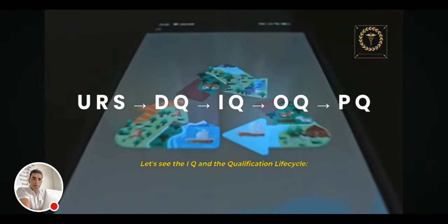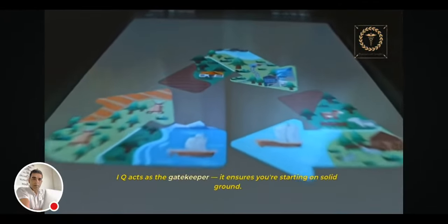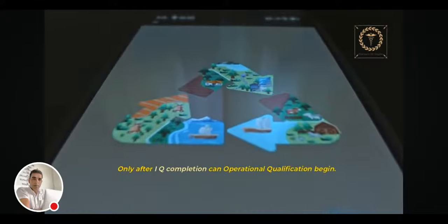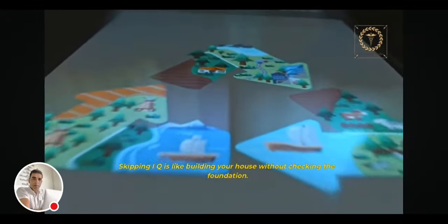Let's see the IQ and the qualification life cycle. IQ acts as the gatekeeper. It ensures you're starting on solid ground. Only after IQ completion can operational qualification begin. Skipping IQ is like building your house without checking the foundation.